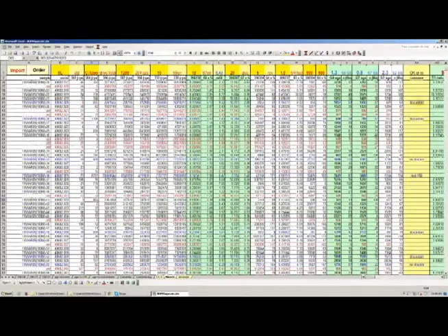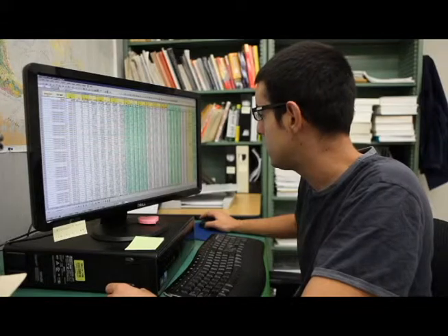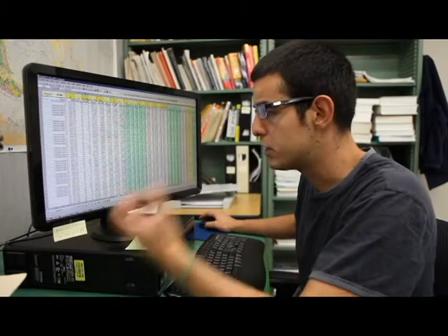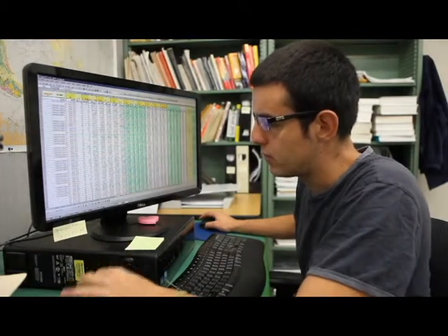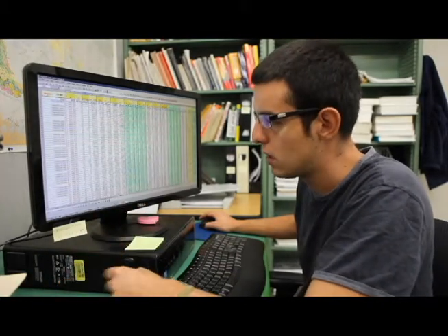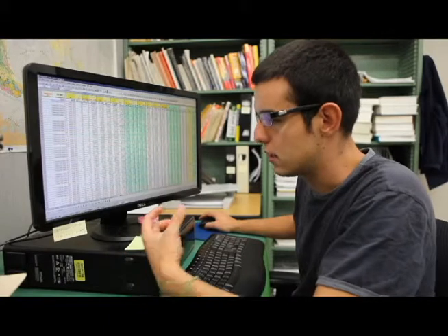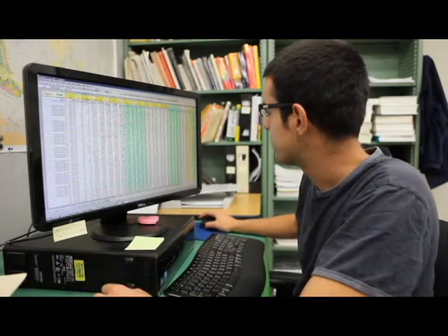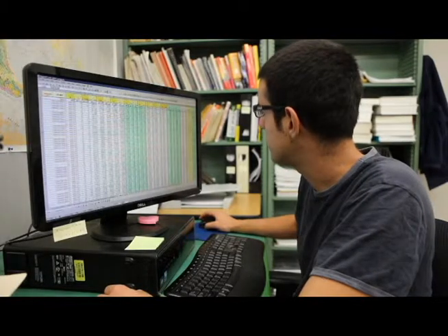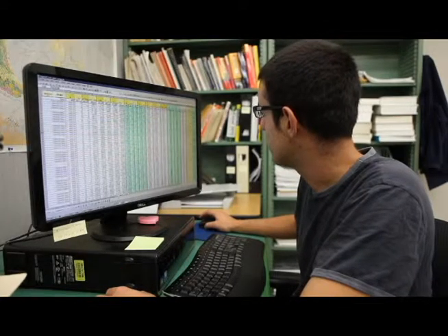Okay, so as you'll see now, a lot of these grains are just being rejected because they are normally discordant. And in some cases that's fine, depending on what the objectives are that you have. If you're after a very precise and very accurate age of a particular population, you don't want to introduce any noise by including grains that have high discordance. But if what you're after is the complete story of provenance, sometimes you can bias your data set if you selectively exclude some of those discordant grains, and we'll discuss that in another video when we talk about the interpretation of detrital zircon samples.